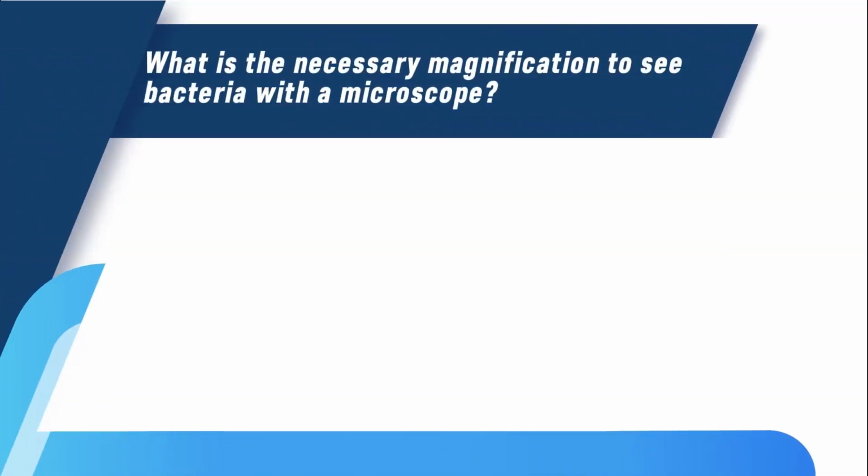What is the necessary magnification to see bacteria with a microscope? To view bacteria under a microscope, various magnifications are typically used. The specific magnification depends on the size and level of detail required for observation.